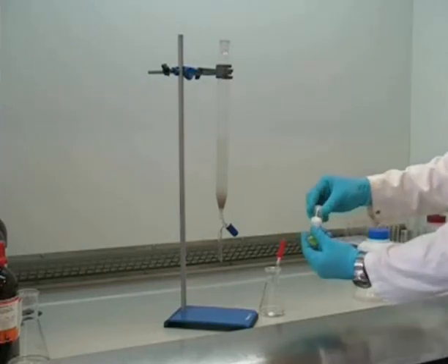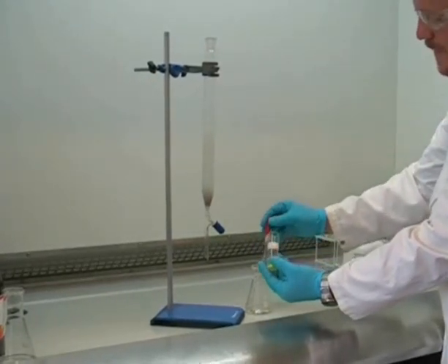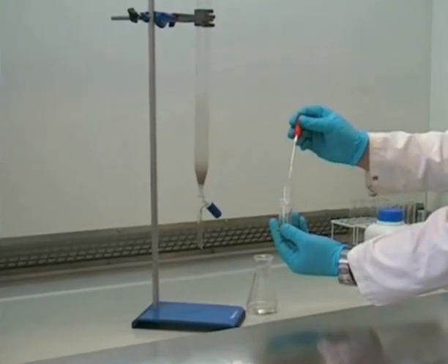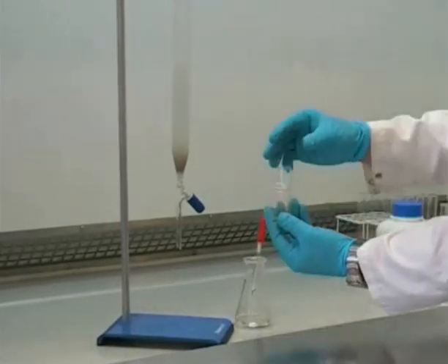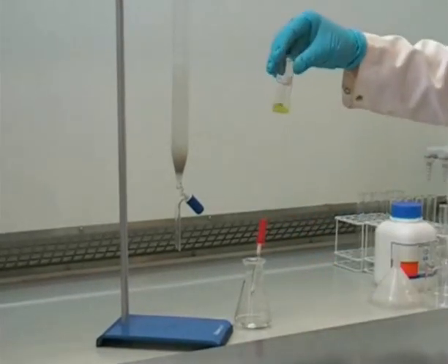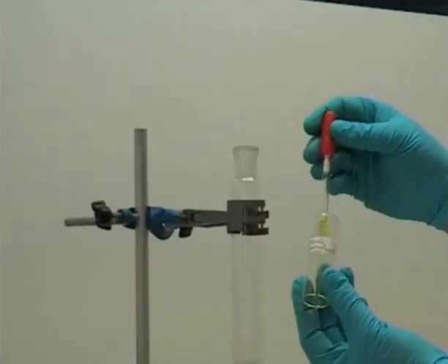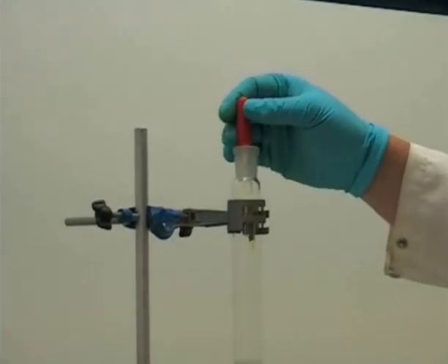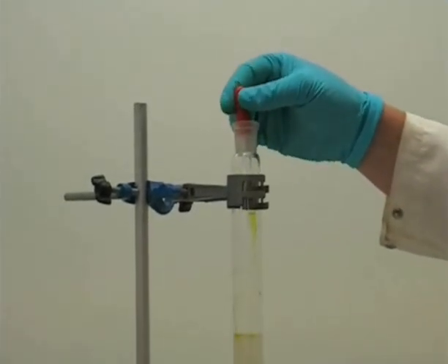The next stage is to load our crude compound onto the column. First of all, we need to dissolve it in a small amount of the eluent. It's important to ensure that all of the crude compound has been dissolved. And then the resulting solution can be added to the column using a glass pipette. Here you can see the solution is being added evenly around the sides of the column.